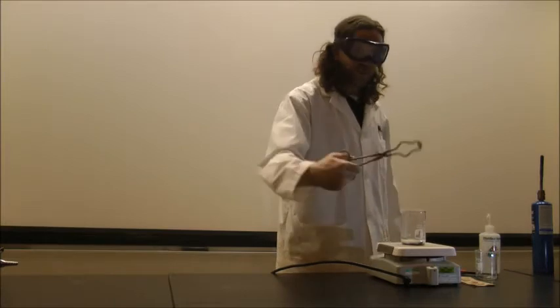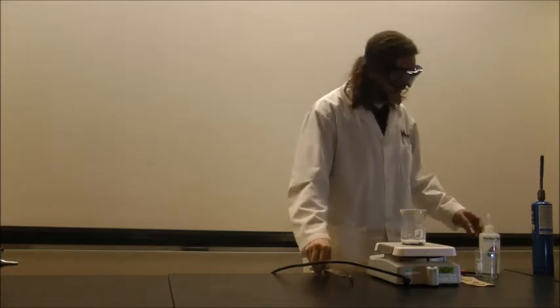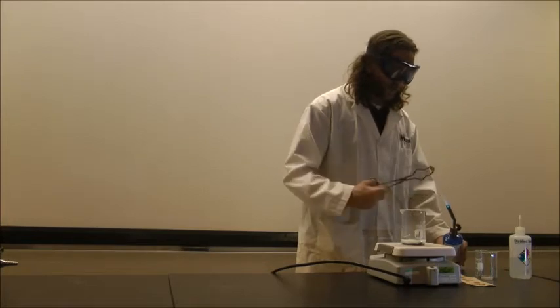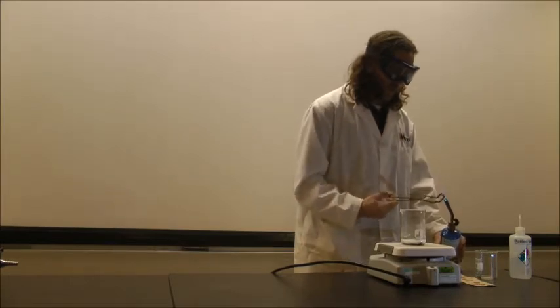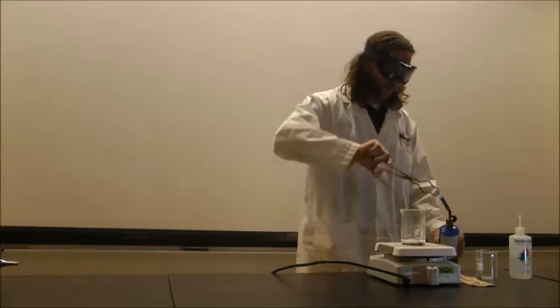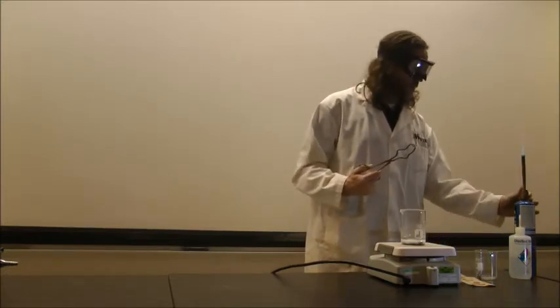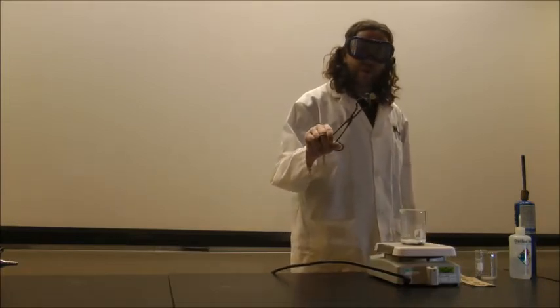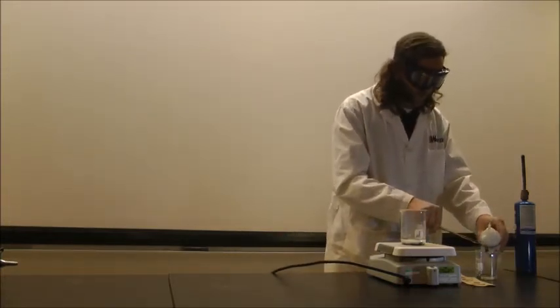Right, so now we've got, once again, a penny that looks very silver. So we're going to heat it. What we're actually doing when we heat the penny is we're forming an alloy. So we're heating up those copper atoms and the zinc atoms enough that they're blending with each other, and we're making a solution, right? Chemists are real big on solutions. So in this case, our solution is a mixture of zinc atoms and copper atoms. And that particular mixture is referred to as brass.